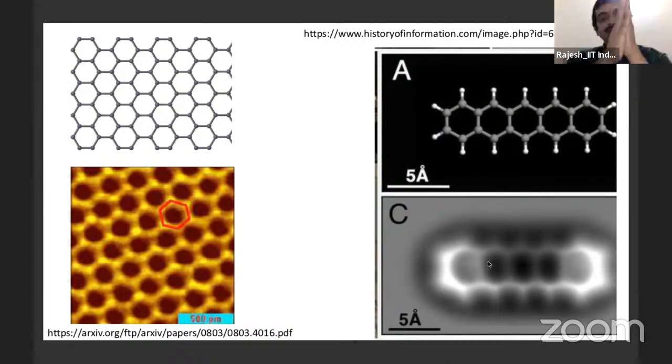So from our eyes, we can see things closer or farther and see a bit more clearly. Then we take lenses so that we can see smaller features. Then we go to the compound microscope, but then we reach a limit. That is restricted because of the wavelength of the optical radiation. So we came to the electron microscope. Electron microscopes were also of a direct method and an indirect method, scanning electron microscope and transmission electron microscope, where we could see very clear features of up to approximately the nanometer range.